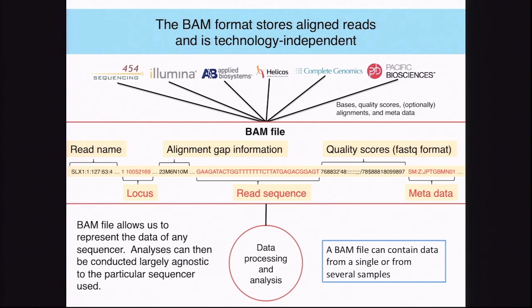Then after that, we have the actual read, and the quality score directly from the FASTQ. And finally, we have some metadata applied from the aligner.